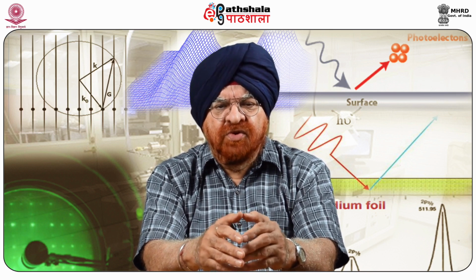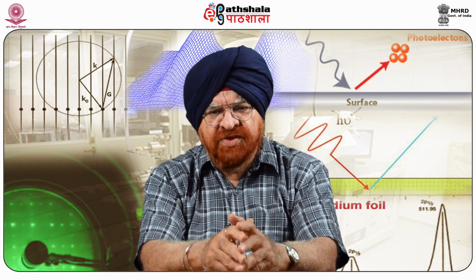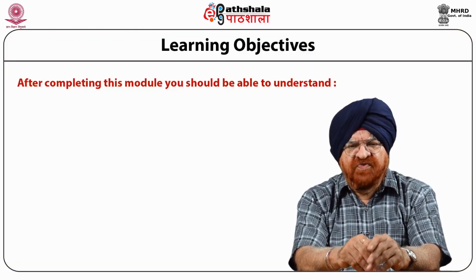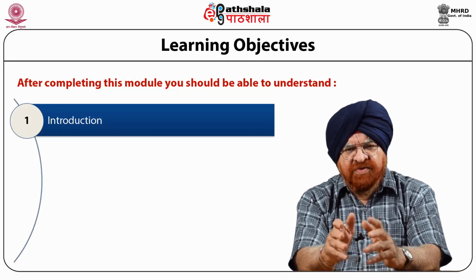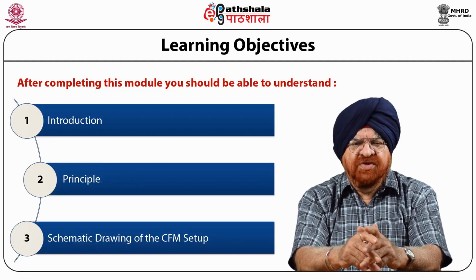Today, we are going to talk about the module Chemical Force Microscopy, abbreviated as CFM, and we shall be talking about the instrumentation part of this. This will come under the paper of Surface Analytical Techniques Part 1. After going through this module, you should be able to very clearly understand three factors. One, introduction. Second, dealing with principles of this. And finally, with the schematic drawing of the CFM setup.